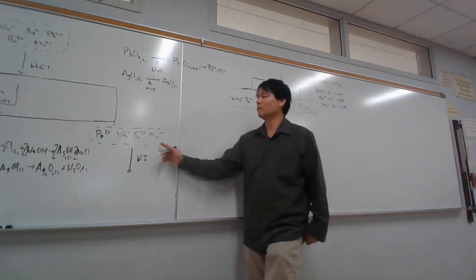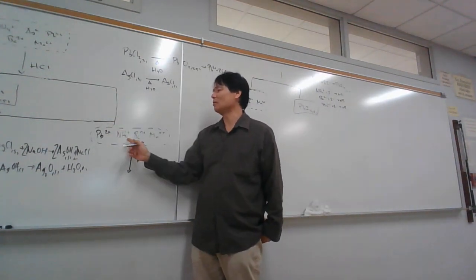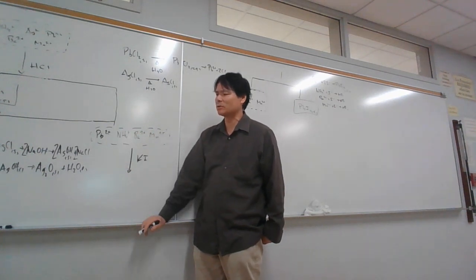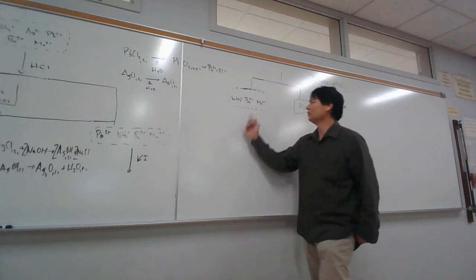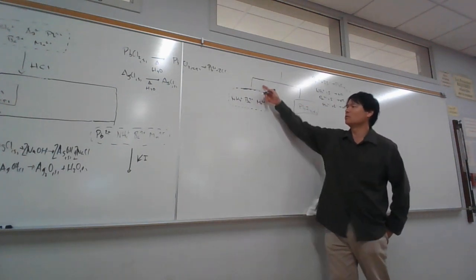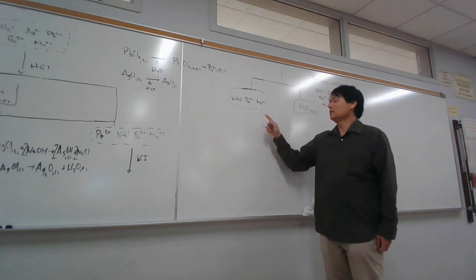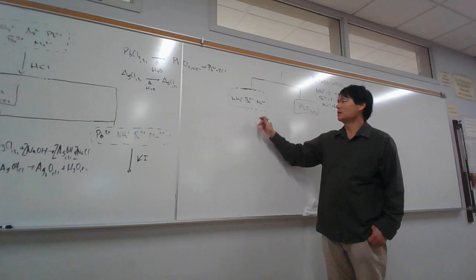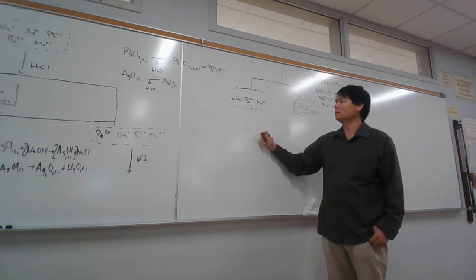Over here, this is going to be a little bit more difficult. We can do the same thing over here by adding 1 more drop of HCl, just to make sure, but you got the lead there, which can precipitate out with the HCl. Over here, nothing should precipitate out with the iodide. And so we just add one more drop to test. The reason is if lead passes through here, it can interfere with subsequent tests, especially the next one. What's the next one?